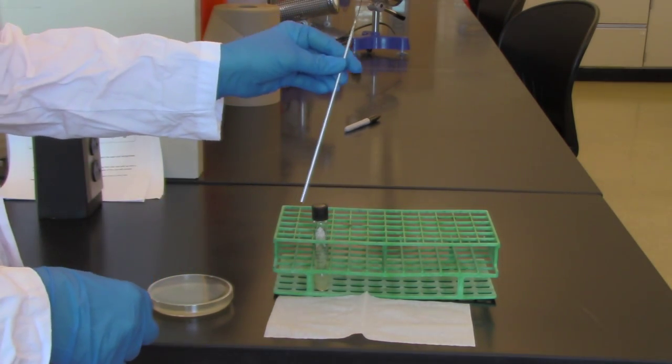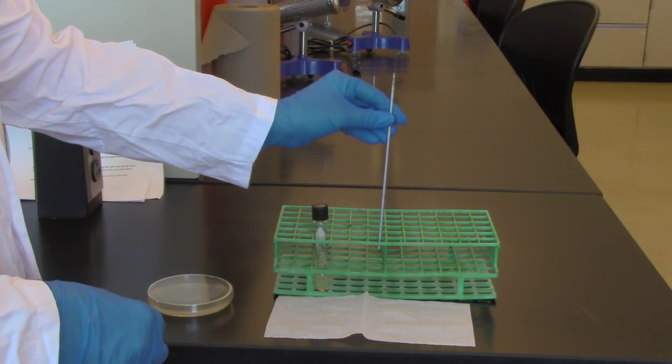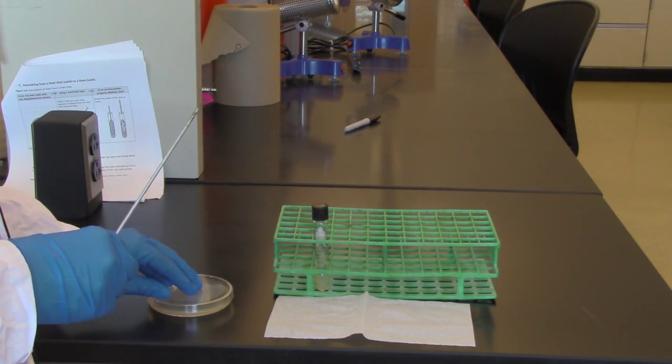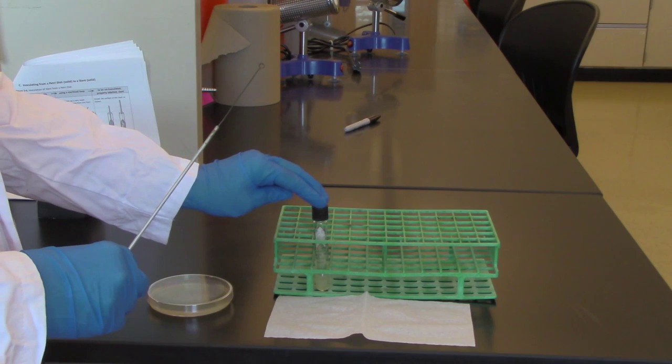Then I will sterilize my inoculating loop. And that is how you go from a culture on a petri dish and inoculate a slant.